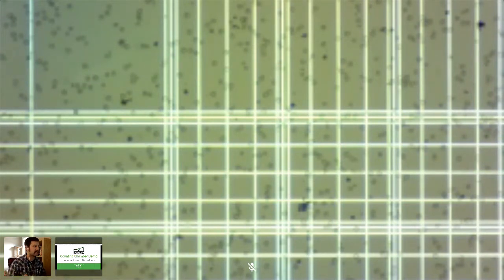I'm probably not going to be able to move around a lot, but as you can see here, there's a lot of yeast on here. This is a Cali strain. As we can see, they're not all clumped, which means that this is pretty easy to count. I'm going to move over to our English strain, and what's really funny is I guess I roused it and shook it up enough that it didn't clump up. But generally, whenever we're working with English strains, they're extremely difficult to count. So we have to actually treat them with a chemical.